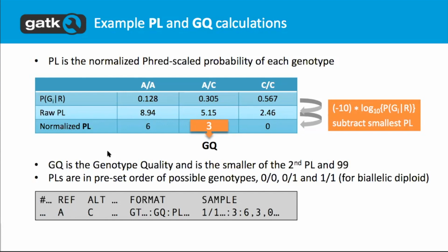In general, we use it to transform numbers that are difficult to work with and represent succinctly into numbers that we mostly round to integers, because they take up less space and allow us to capture the value without having to do as much work in our heads and in the file.